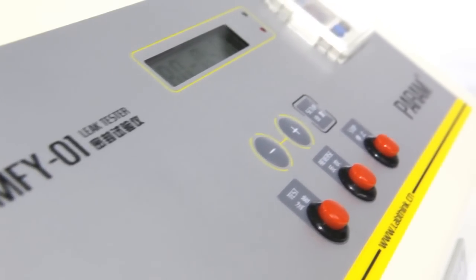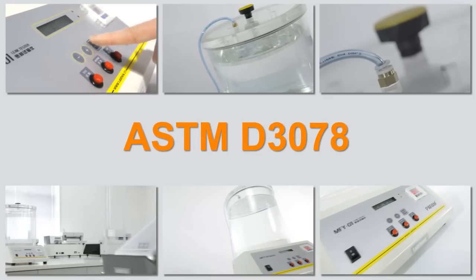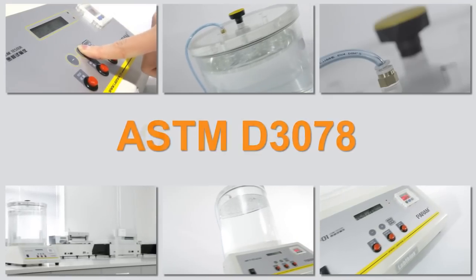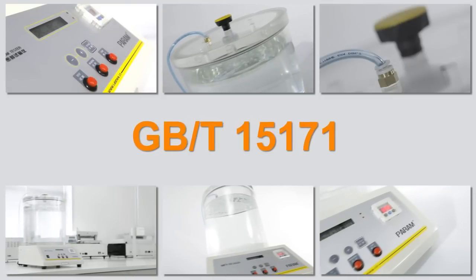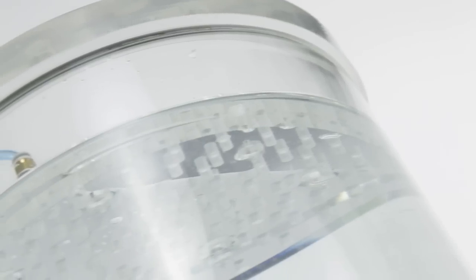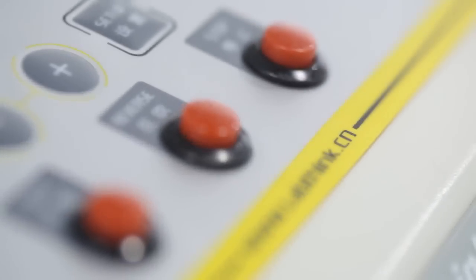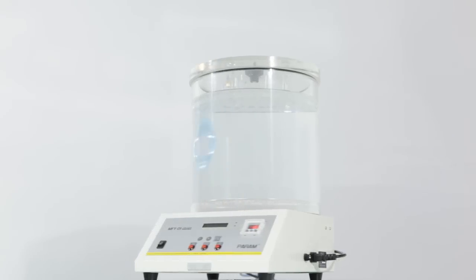The testing principle complies with ASTM D3078 and GBT15171 standards. MFY-01, your excellent choice for automatic leak testers.